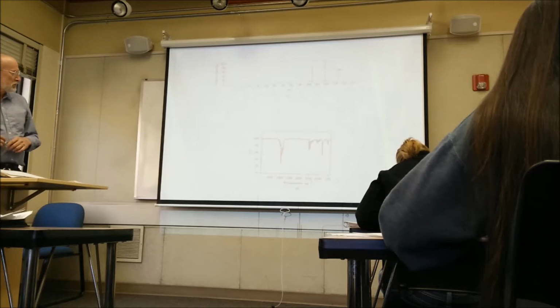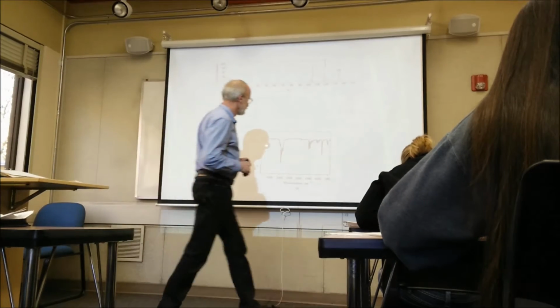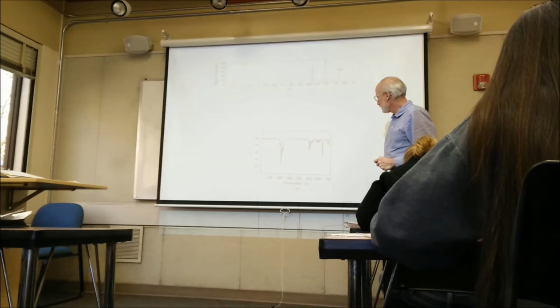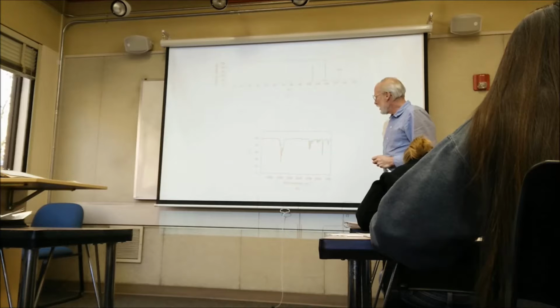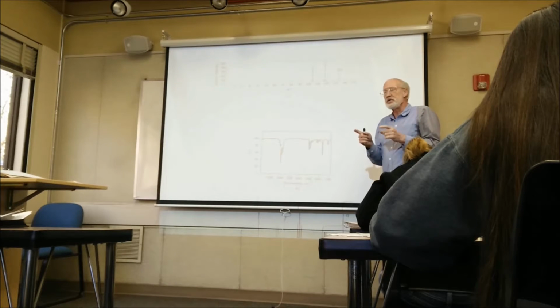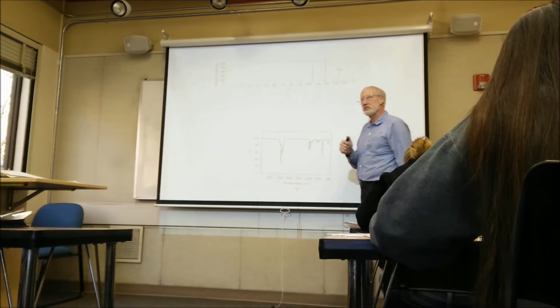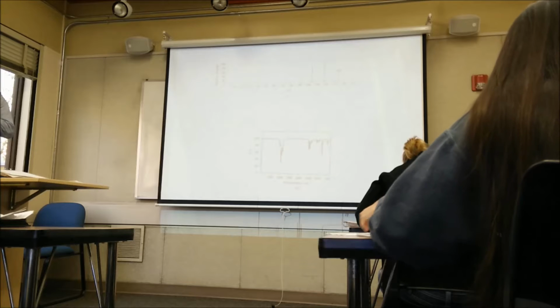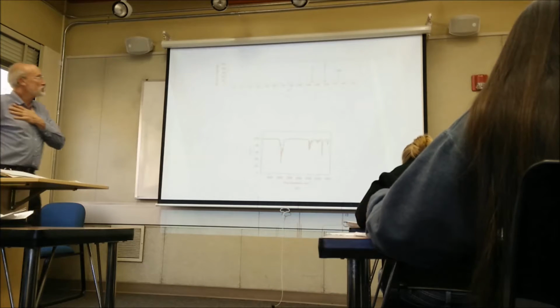Can you tell from that? Is the ether peak very pronounced? I mean, there are sort of some peaks around 1400. Well, the COC stretch is a pretty large peak, because the carbon-oxygen bond is a fairly polar bond. So as a first guess anyway, I'm going to say that it's not an ether. This is a hydrocarbon. Okay, so we know it's a hydrocarbon.